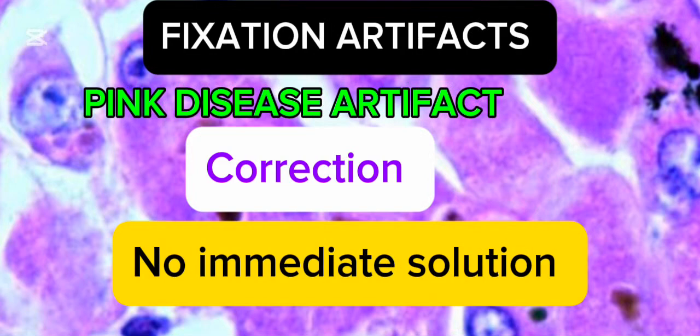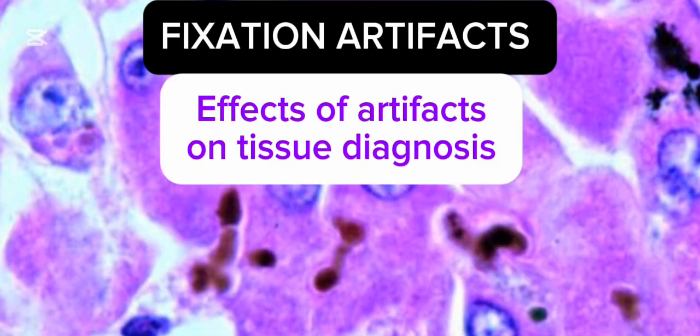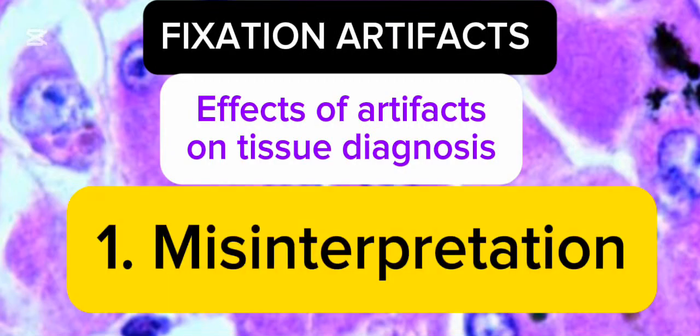Lastly, what could be the general effects of artifacts on diagnosis? 1, these artifacts can lead to misinterpretation. So artifacts can resemble pathological changes, e.g. deposits, pigments, or abnormal staining patterns, leading to incorrect diagnosis.